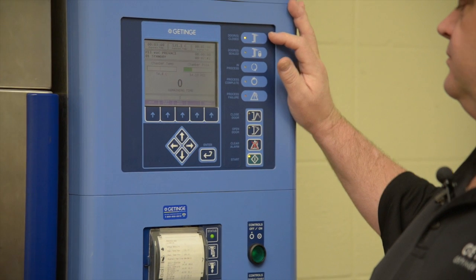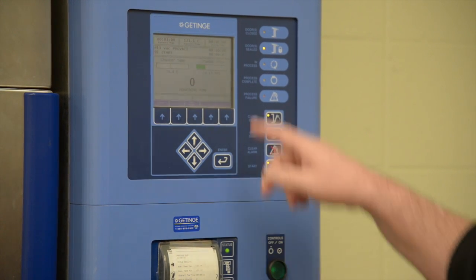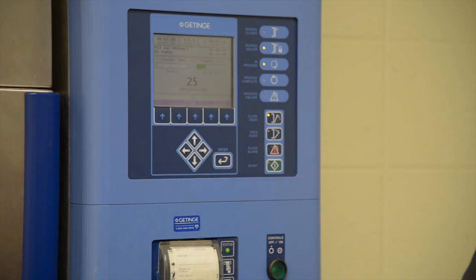The door will seal, and once the door is sealed it goes into what's called purge. Purge is the first step in both liquid gravity and vacuum cycles. During purge we are pressurizing the chamber with steam while the drain valve is open — we're actually pushing the air out of the chamber. You cannot sterilize anything that has air contacting your load, so it is vitally important that we remove all the air, or as much of it as possible, to assure that your load can process.